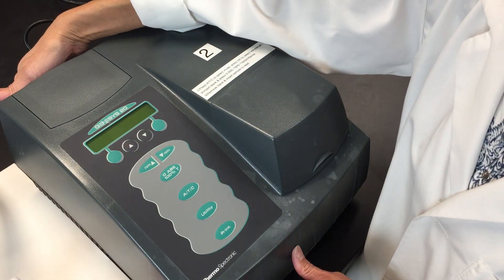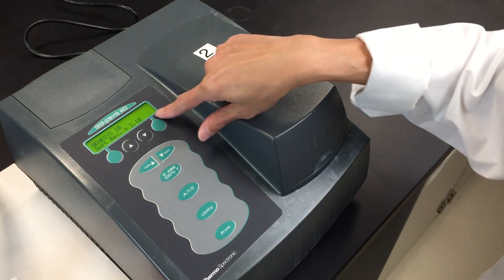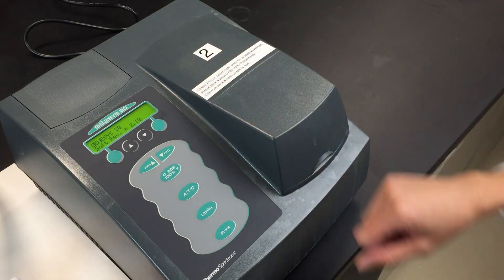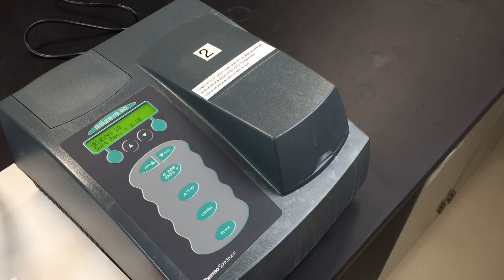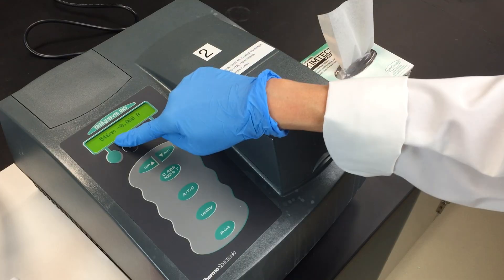Start by turning on your spectrophotometer and letting it warm up. This is what the screen looks like when you first turn it on. If you don't let the spectrophotometer warm up properly, you'll get an error message when you try to use it. This is what the screen looks like when it's warmed up.